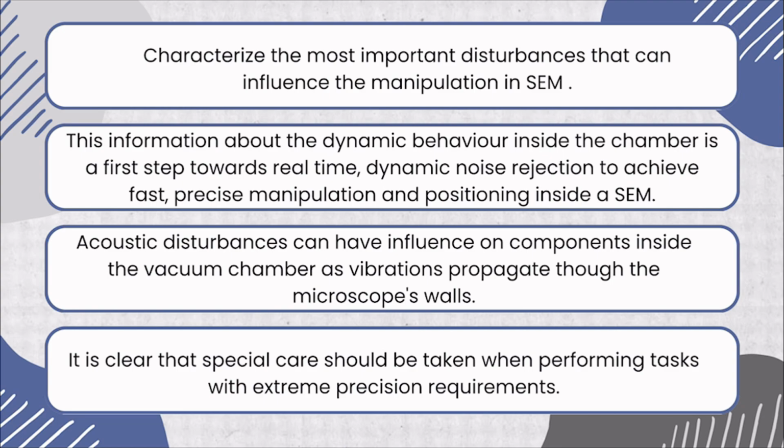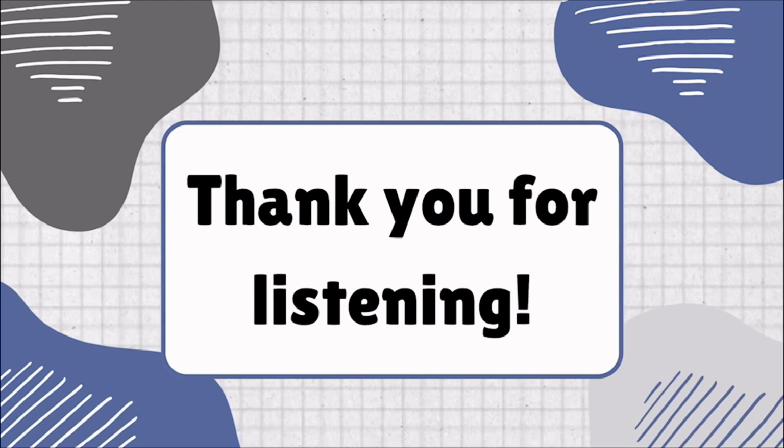Finally, this study shows the importance of taking both environmental and internal disturbances seriously to meet the extreme precision requirements for SEM-based tasks. With careful consideration of these factors, we can improve the reliability and accuracy of operations in SEM. And that's all of our presentation.